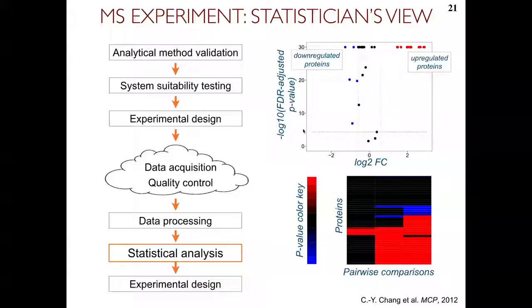And we would use the horizontal cutoff. This is statistical significance, meaning that everything above this cutoff has the false discovery rate controlled at that level. And we can also add, after that, vertical cutoffs, which we call practical significance, where we say, you know, for whatever we do after with this data, below fold change of 2, we're not interested, right? And this is totally fine as long as it's in addition to statistical significance and not instead of statistical significance.